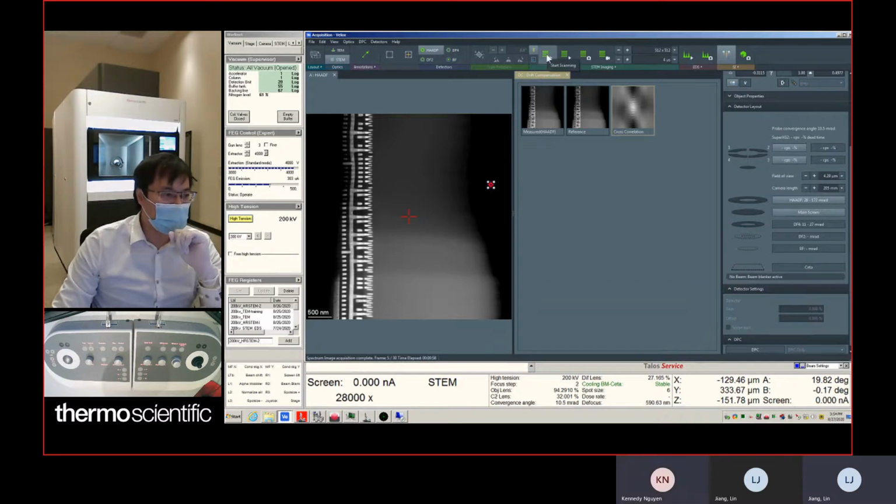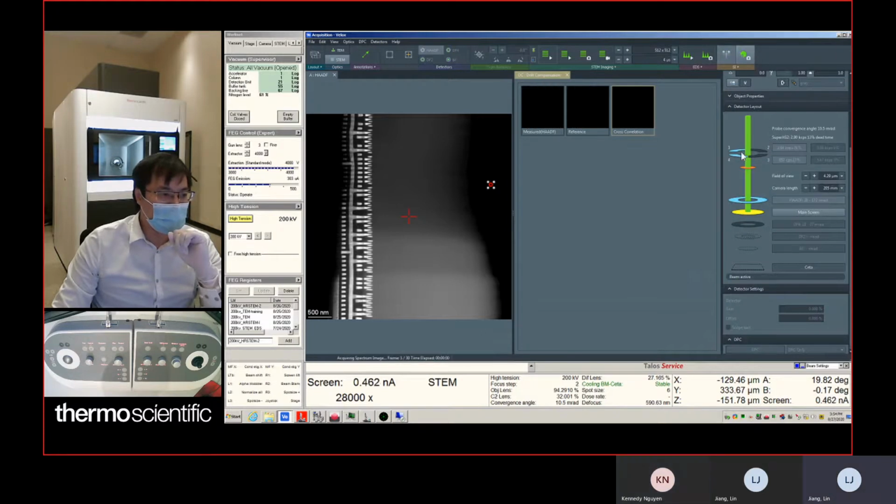Yeah, and then the positions of the detector may make more sense, and then they may affect the signal, right? Yes. Then you see you have detector on the left on, the right 2 is off, right? Yeah. So, and then you see how much count you get on the left 2.